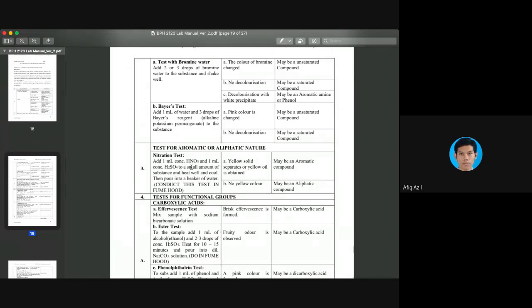Sometimes the tiny explosion may be too big, so it spills out of the test tube itself. But it only lasts for a few seconds. After that, the reaction will subside and the temperature will start to go down again.